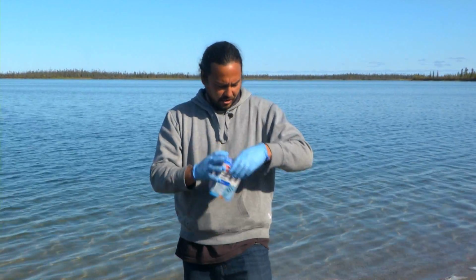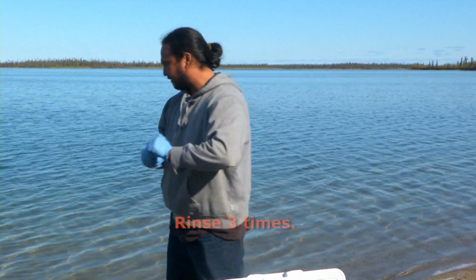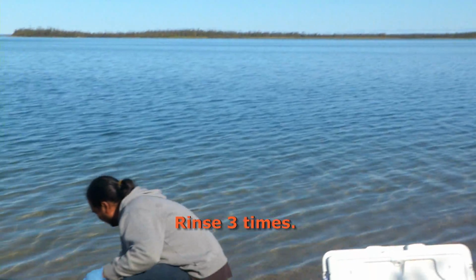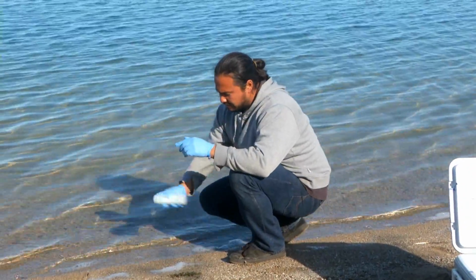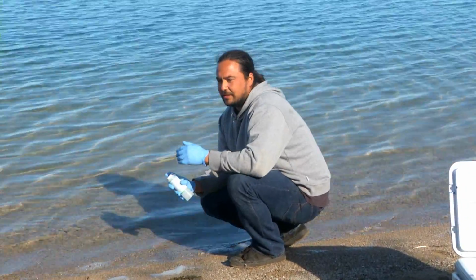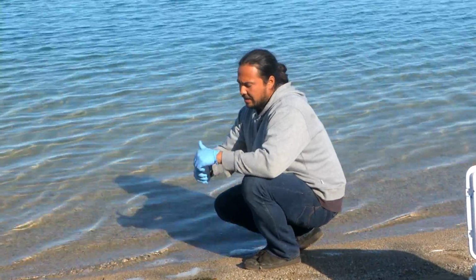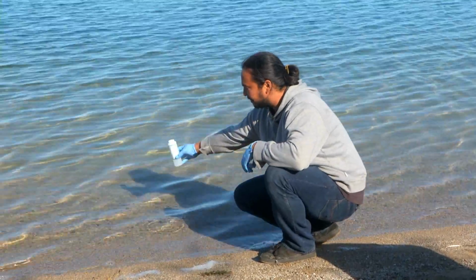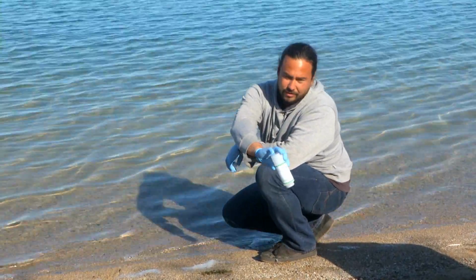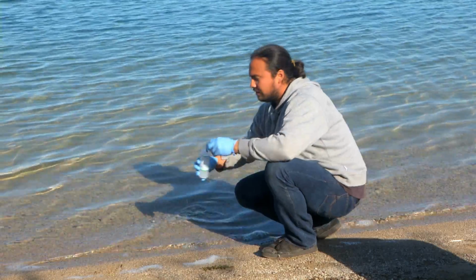When we're doing the 3 jars, one thing you're going to want to remember, every time when you're filling it, you have to rinse it 3 times. And you don't have to fill the bottle to the top. For now, we're doing this demonstration on land, but it'll be out in a boat, out in the lake. And you'll always want to remember when you're taking a water sample to take it from upstream and to pour the rest out downstream, so you're not collecting the same water that you just spilt out.